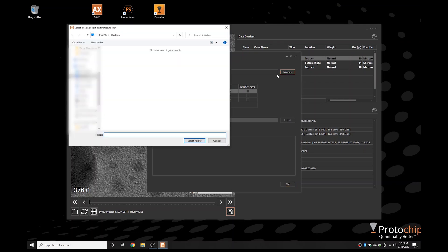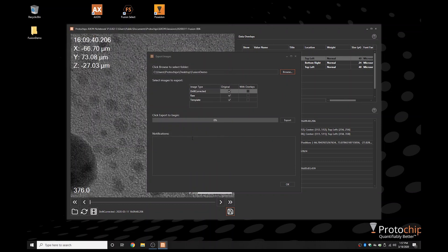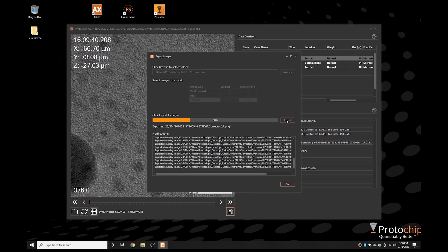Exporting data is incredibly easy. You can select either the raw uncorrected files or the corrected data sets and transfer them with or without metadata overlays applied. These are exported as lossless PNG files, a non-proprietary standard that is open for your flexible use.